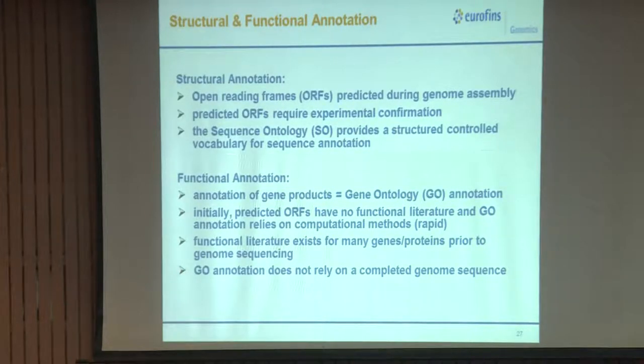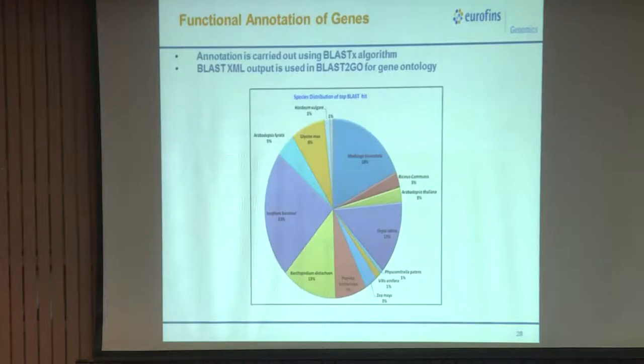So in annotations, we can segregate them into structural and functional annotation, and we can identify the genes, the exons, introns, all these things. Once the functional annotation is there, we can see the species distribution, because it is not necessary that in NCBI it will hit only your species. For example, if I am doing de novo and a homology search, I will have genes which are getting categorized in several genomes. So I can identify which are the major genomes they are getting segregated in. The top one should be your nearest one; then the annotation and the genome assembly are said to be comparable and similar, right?